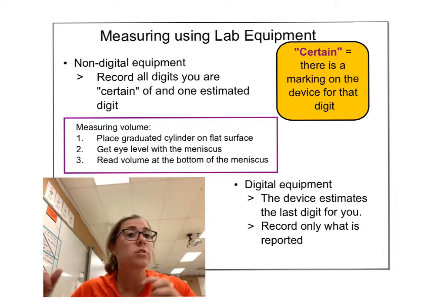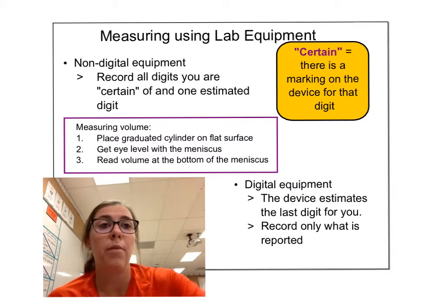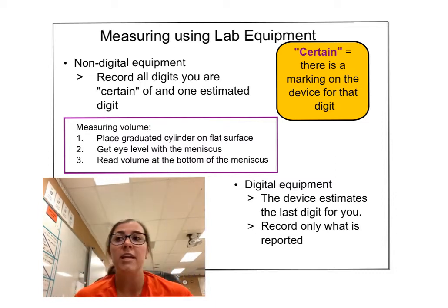How good is your lab equipment? So here's what we do. First of all, if it is non-digital, meaning it doesn't give you a reading, like a balance gives you the reading. It's a digital tool.